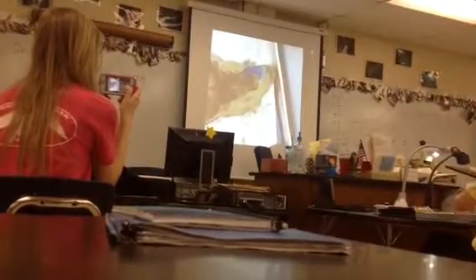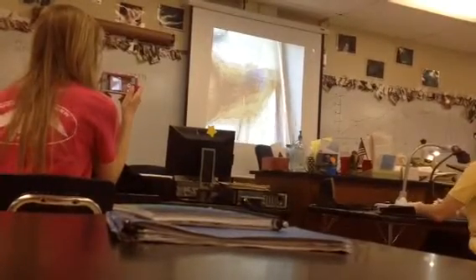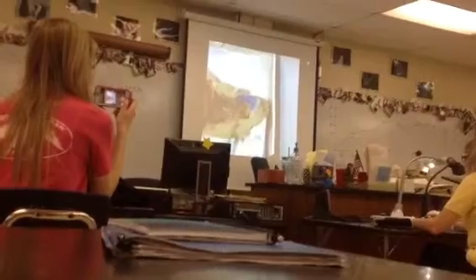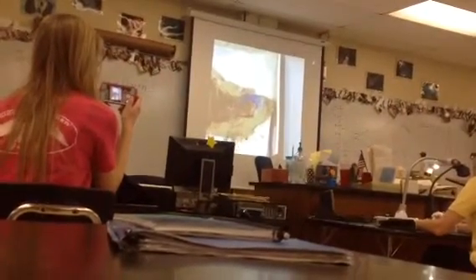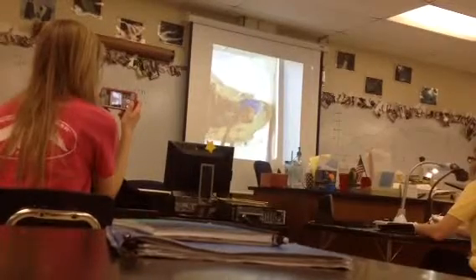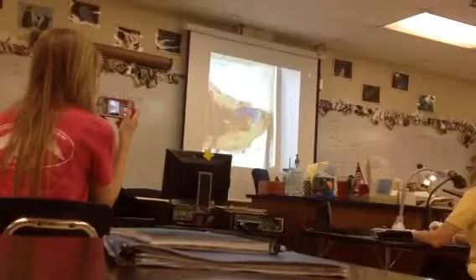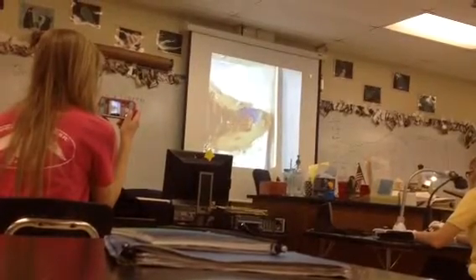And on this rat, this one's hard. You're going to have to be able to identify the trachea, and you can even see the cartilage rings in that trachea. And then it splits, and those are the bronchi, where it splits, and then these are the lungs.